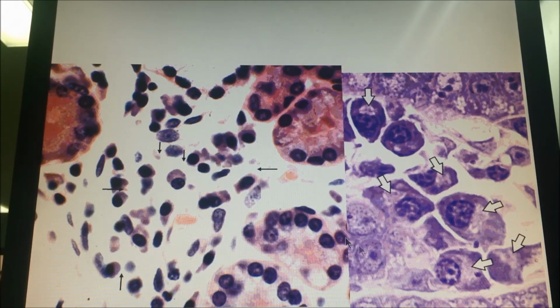On the section to the right, the same thing, and here we zoom in to the characteristic look of the plasma cell. Peripheral nucleus with the clock face appearance. Above it, where the pointers are, is the clear zone, the juxtanuclear or supranuclear Golgi apparatus zone. The remaining cytoplasm is basophilic, with large amounts of RER. Of course we need a large amount of RER.